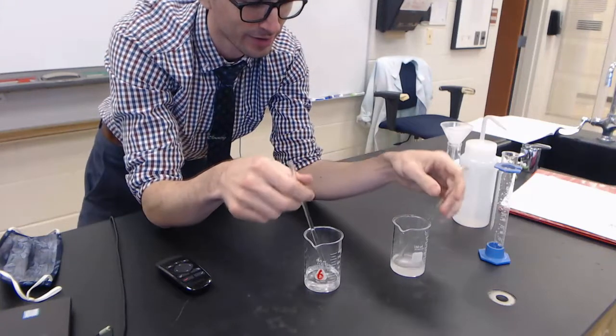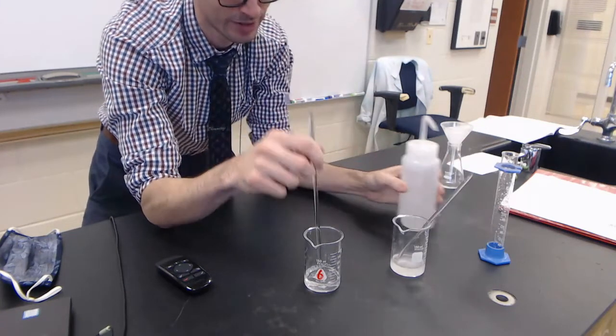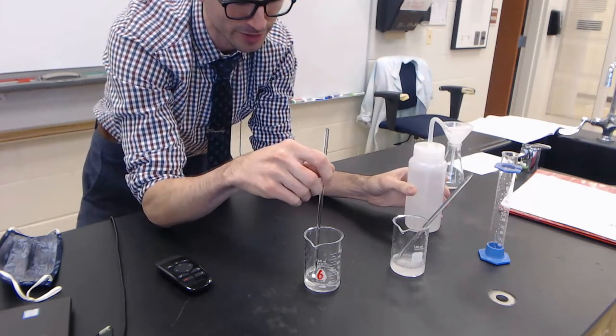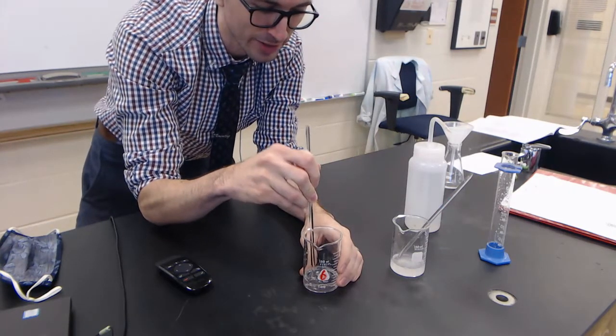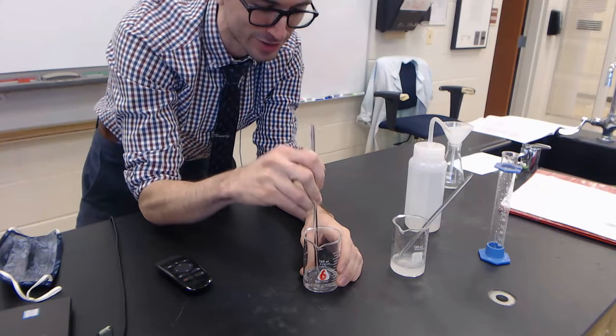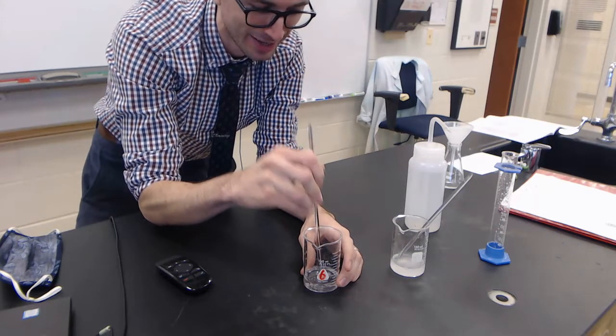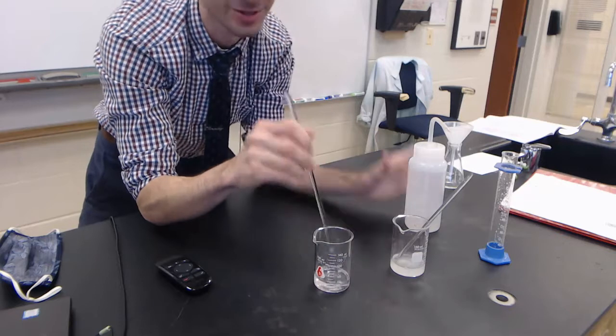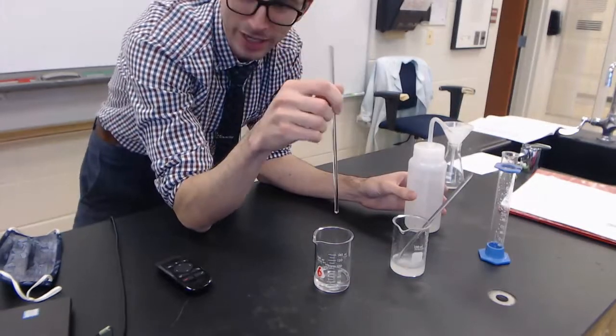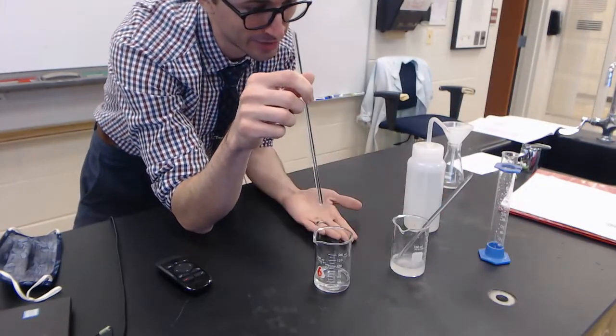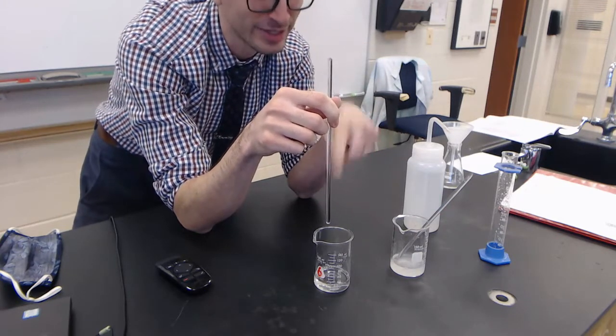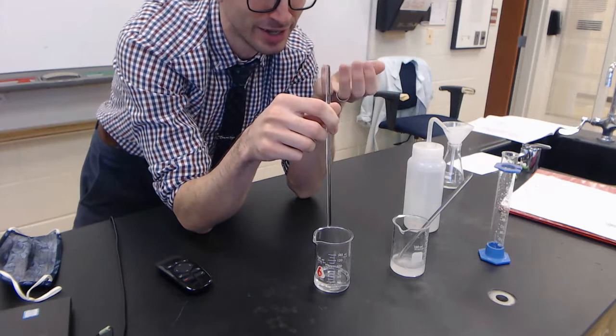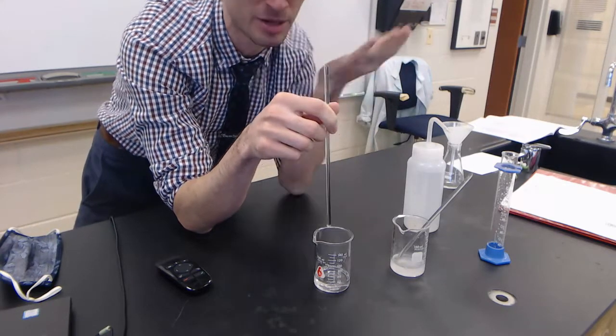One thing you're going to see me do here is—I always relate this to chili. If I just take this stirring rod and put it on the table, I lose some product, just like if I eat chili with a spoon and then take the spoon out and put it on the table, I'm going to get chili on the table.